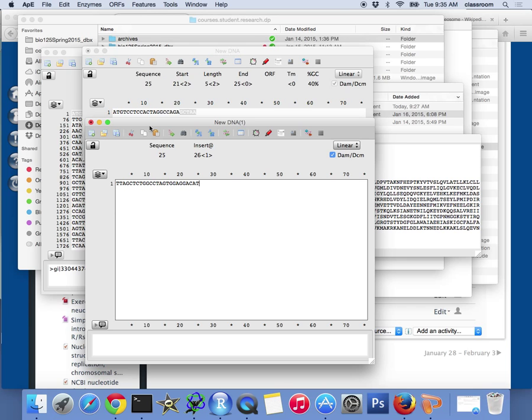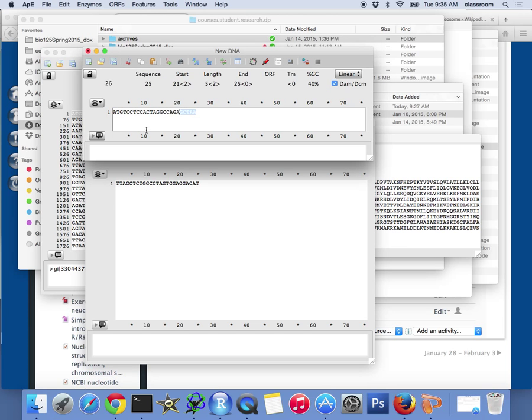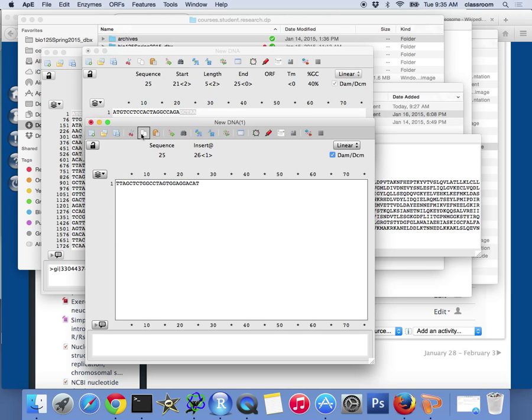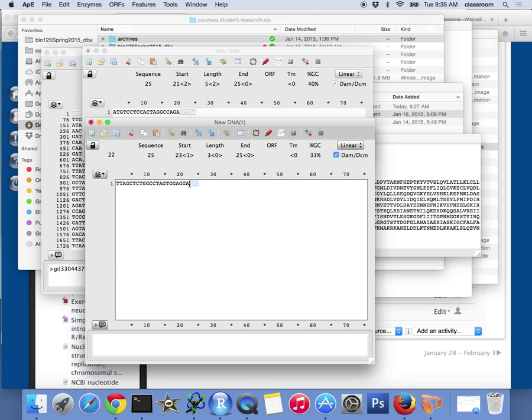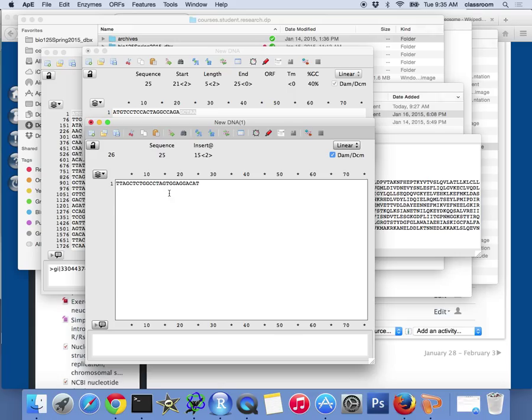And you can also verify the last five. So this is the T, it should complement to A. That A should complement to T, so ATG should be the complementary base pairing. You can verify the rest of it, so that's okay.